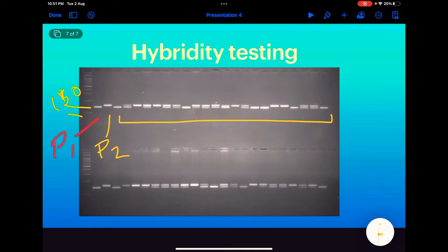Now consider the first lane from our F1 population. The first sample or the first individual has an allele at 150 base pair. It means it shows that only a single allele from parent one is inherited in our first sample. Now in second, both the alleles from parent one and parent two, that is of 150 base pair and 170 base pair, are inherited in the second sample. It shows that it is heterozygous, that is a true F1 hybrid. Again in third sample, a single allele from parent two is inherited here. This is how we will assess the rest of the samples.